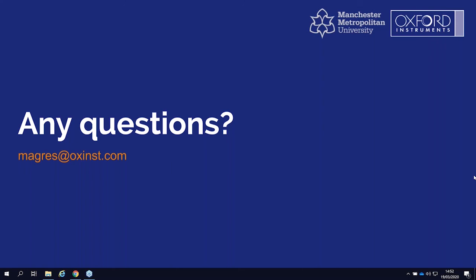So I'll answer that question. There is actually a hardware consideration there, which is linked to the peristaltic pump. The quicker you try and flow the liquid around the system, it tends to generate a bit more back pressure. I only went up to 10 mil per minute, mainly because it just seemed a nice place to stop. But at that point, there was absolutely no back pressure being generated on the peristaltic pump that I'm using. It's got a nice digital readout that tells me about this.